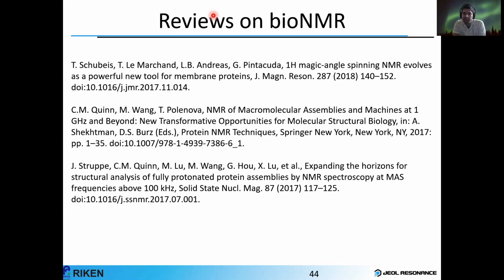We have a follow-up question to the same discussion from Aaron. In a disordered material, would the broadening of the 13C signals not make proton detection a more appealing option? Broadening, yes. I think this is with regard to the point that Vipin mentioned, where slow MAS may be advantageous for inhomogeneously broadened amorphous materials. If we have inhomogeneous broadening in the carbon-13 dimension, proton detection gives us much higher sensitivity than direct detection.